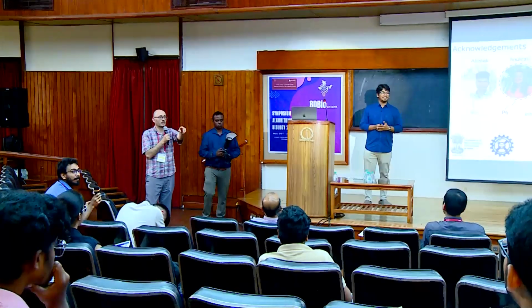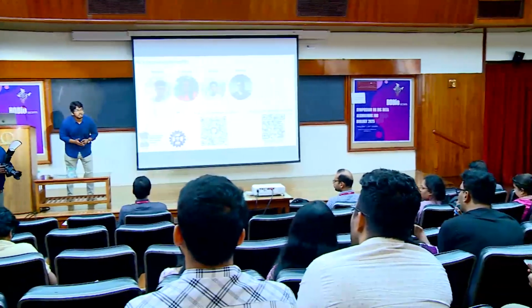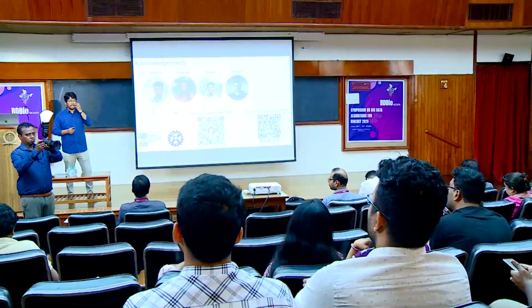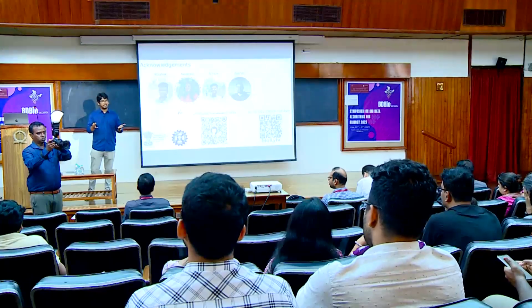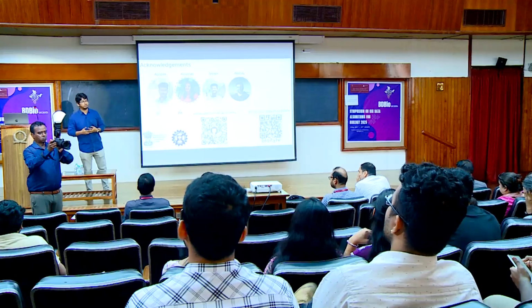I think there was one last question. You're starting with defined sets of sites. Is it possible to run for de novo? So without telling the TR location, at present, no, but that's a good point. We will think of if we can do that. Yeah.